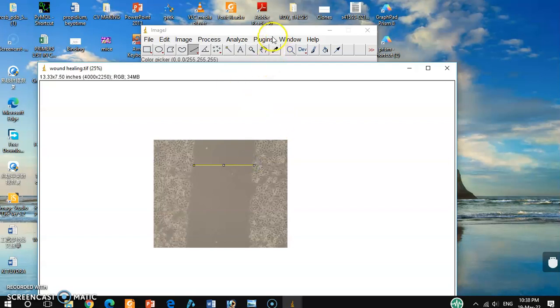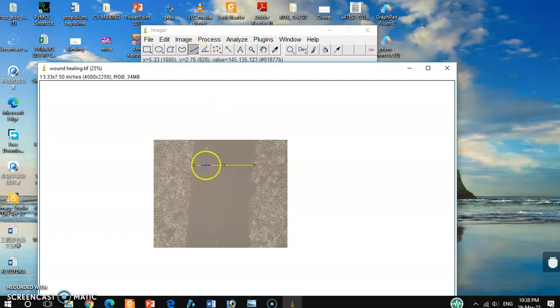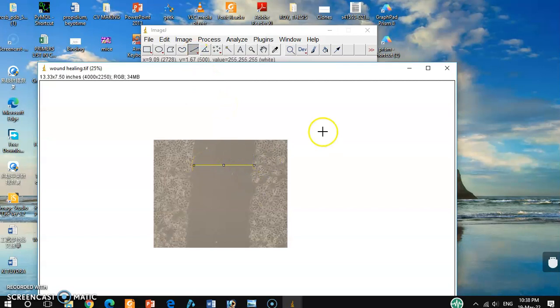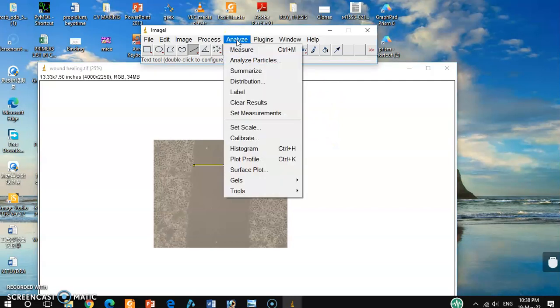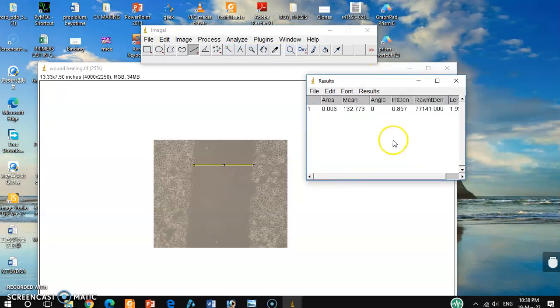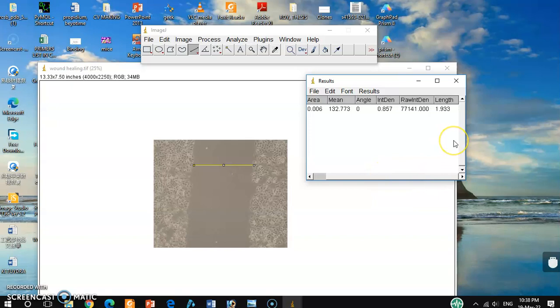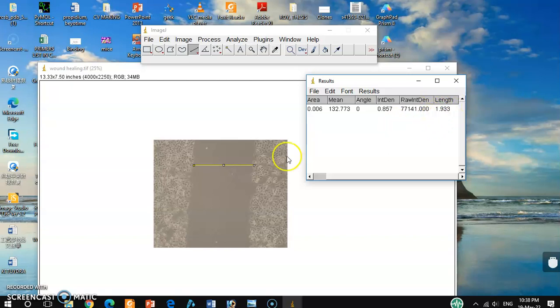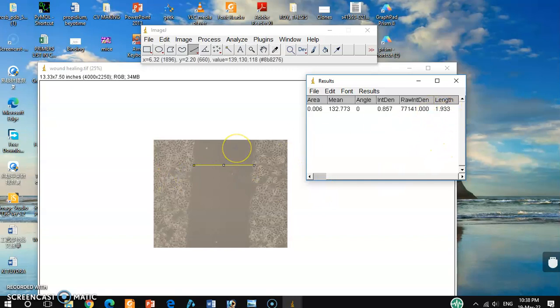For that, you have to click this option and then you will get this kind of pointer. It's done, and then you have to hit analyze and click measure. When you click measure, a small window will pop up and you see here the length. This is the exact measurement of this distance.